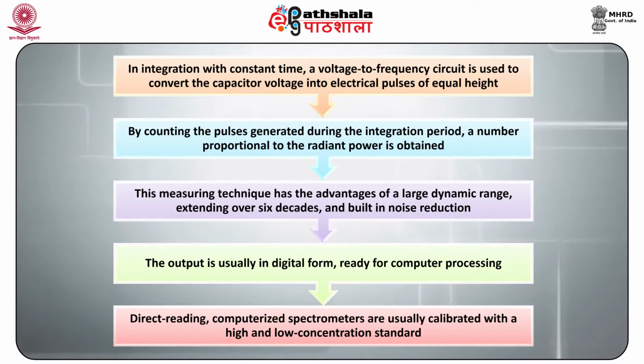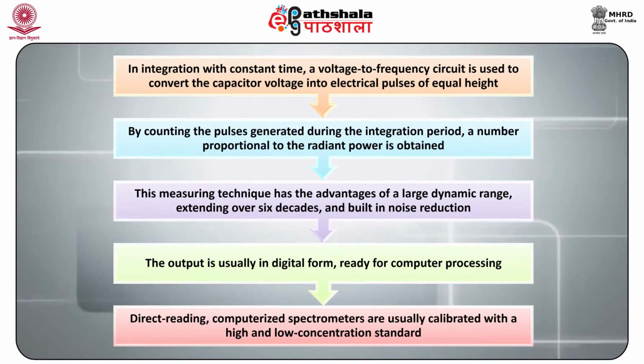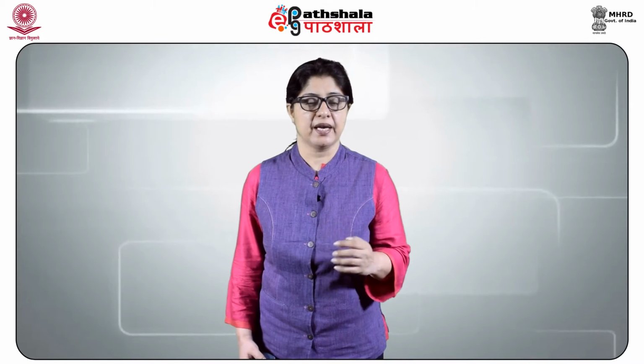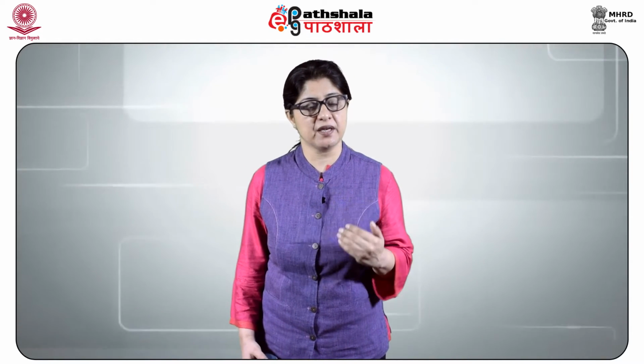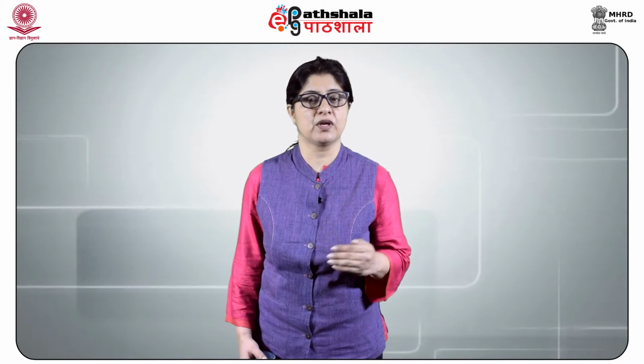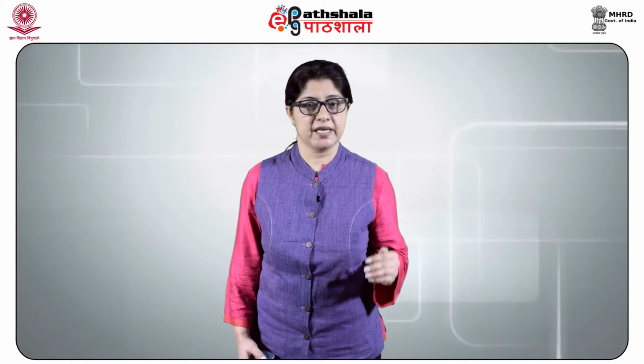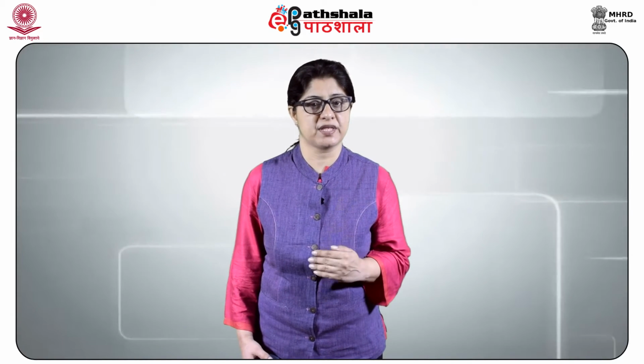Computerized spectrometers are usually calibrated with high and low concentration standards. Mass spectrometers. The mass spectrometer system used for the purpose can both process data and generate reports. The detection limits for many elements are significantly lower than those observed for ICP AES systems with photographic or photoelectric detectors. ICP MS systems also permit the determination of the isotopic composition of samples.